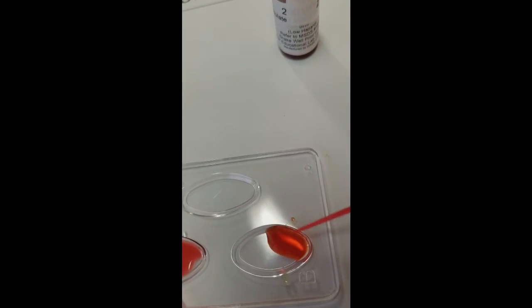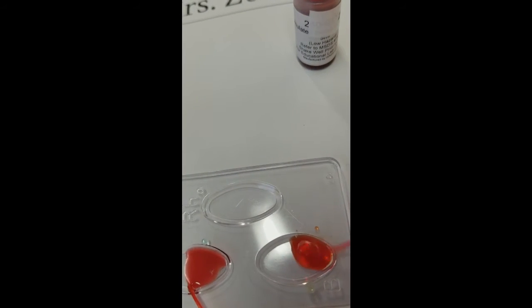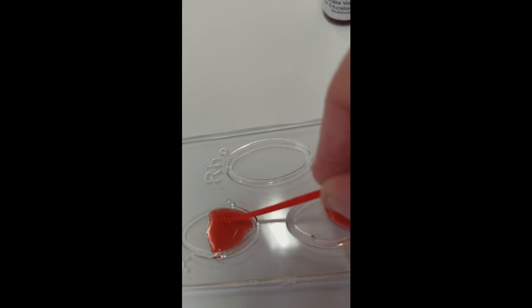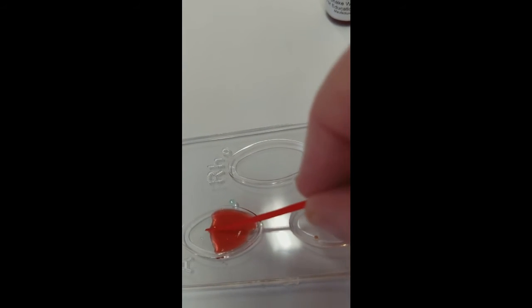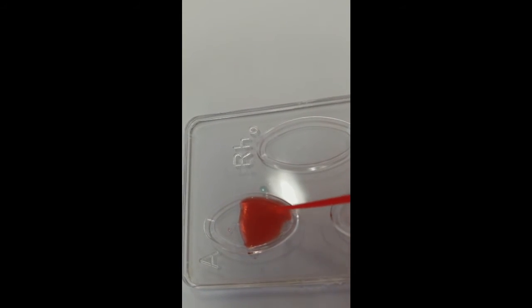Now, in this case, do you see how in here, the liquid is all thin, no little black dots? But in this one, you see this one looks different. This one has some little dots in it. It's a little bit thicker. It looks almost like it's turned to jelly a little bit. And you can kind of tell by looking at it, I don't know if this is a good video to see it, that there's little black dots in it.